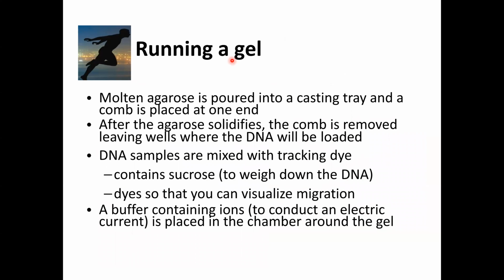So basically, literally, it is running a gel, because of course you need to run a gel. It's used after your electrophoresis; people say, "Oh, I have to run a gel," meaning you have to run your sample in gel electrophoresis. It's a term in molecular biology or even the laboratory.